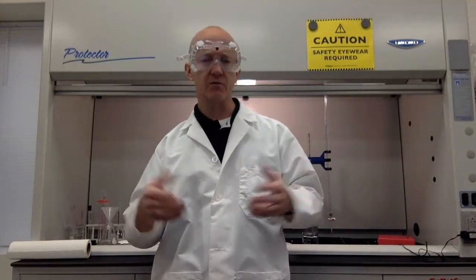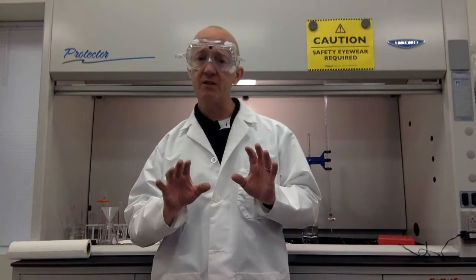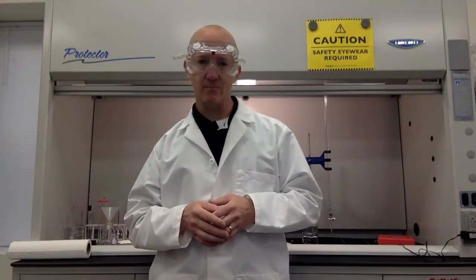Now that's not by any means an exhaustive list of equipment you'll find in the chemistry lab. But if you recognize those pieces that's a great start. Now let's take a few moments and talk about safety in the laboratory.